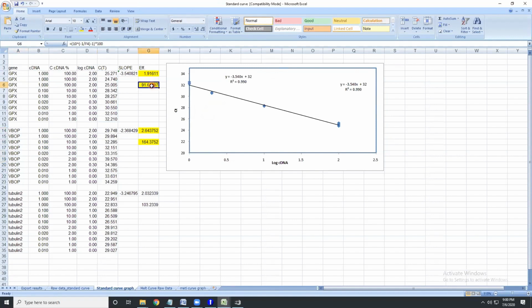And all the formula is already written in the columns. So basically, you have the efficiency, you minus it with 1, which I said after the point you have to consider. So basically, you have to minus 1 and then multiply it with 100. So whatever it comes, it gives you the efficiency. Right? So minus 1 and then multiply by 100.